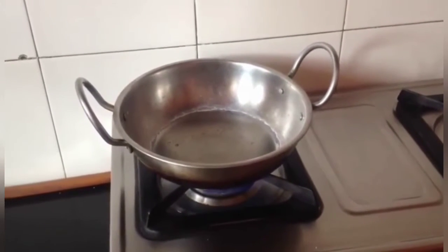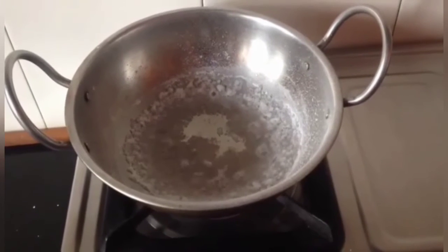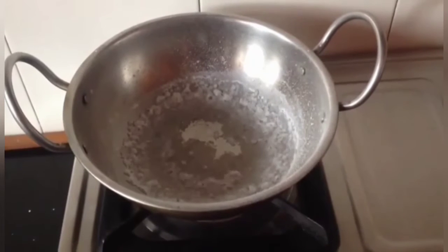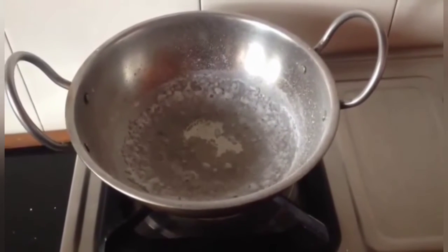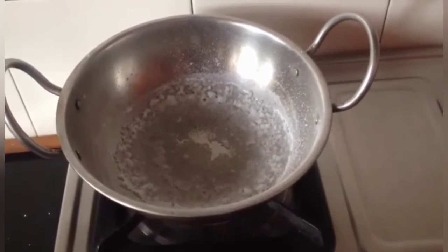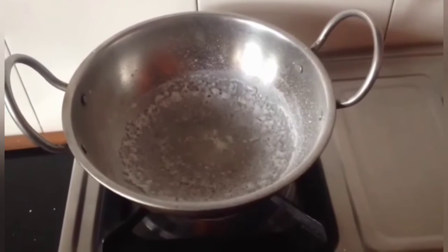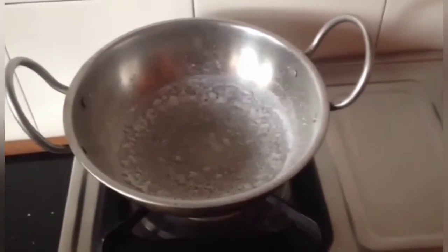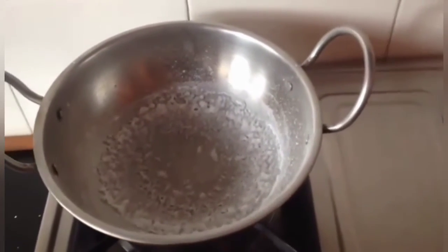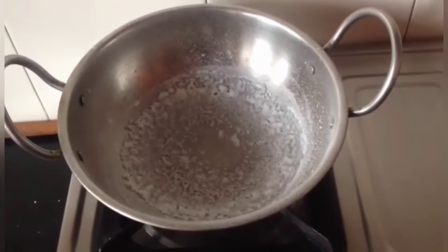As you can see, the water has fully evaporated, leaving behind the salt. Now the water is fully evaporated, so you can clearly see the salt in the vessel.